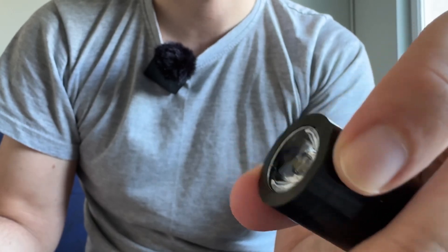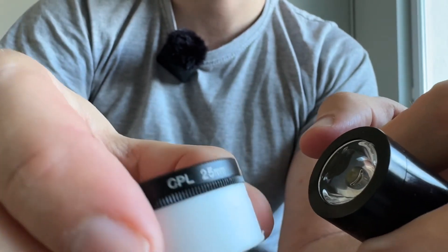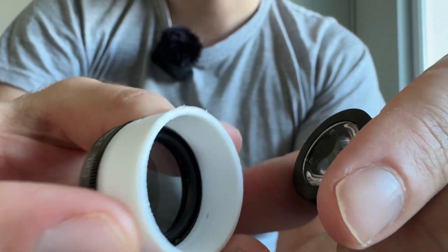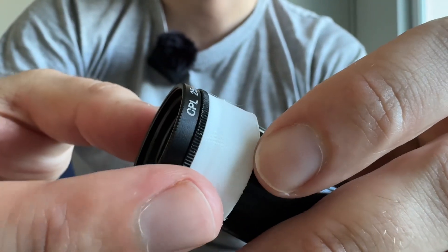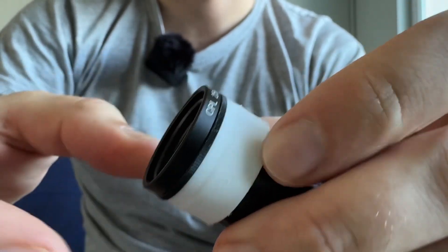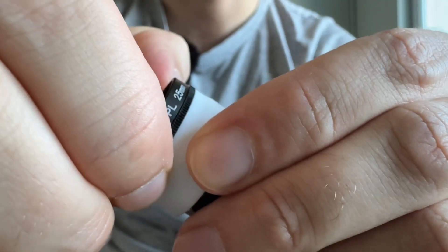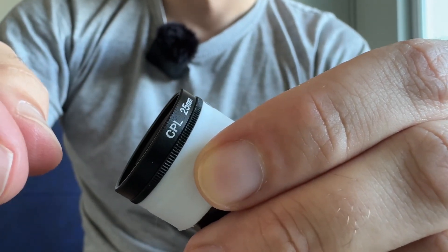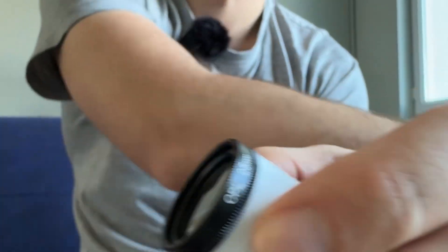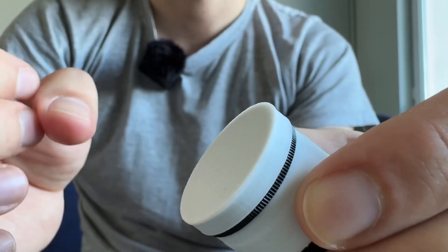And we need to add a polarized filter. I bought it for 25 millimeters. On the 3D printer I created this part — it's simple. Here the CPL filter rotates and makes a thread by itself.